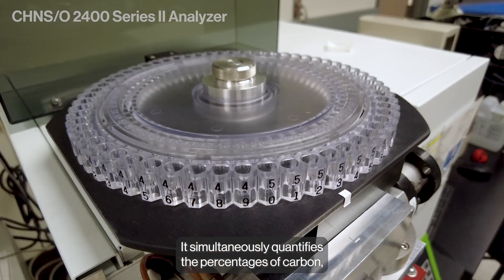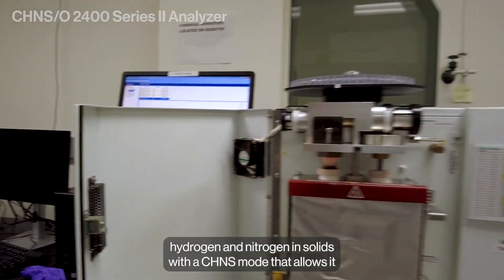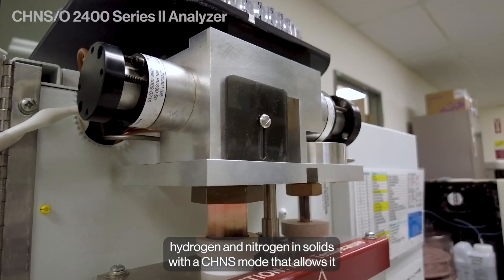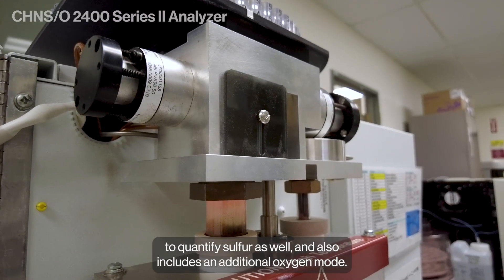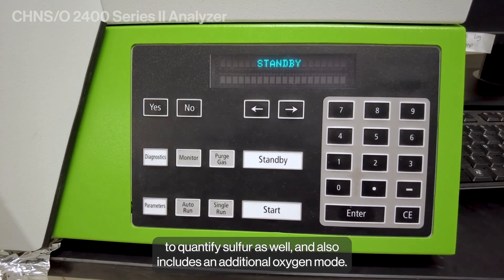It simultaneously quantifies the percentages of carbon, hydrogen, and nitrogen in solids with a CHNS mode that allows it to quantify sulfur as well, and also includes an additional oxygen mode.